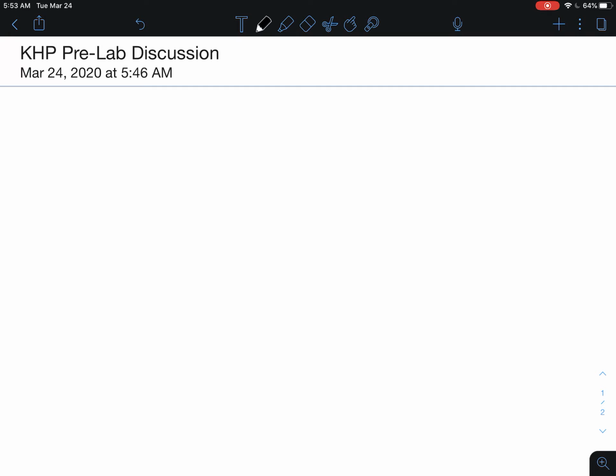All right, so let's go back to chapter 4 when we talked about acid and base reactions. What's significant about them? Let's think very generically about an acid-base reaction that we see a lot: hydrochloric acid and sodium hydroxide. What products would they make?